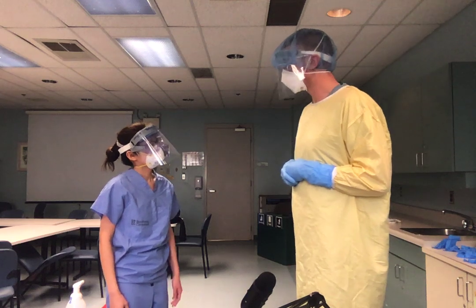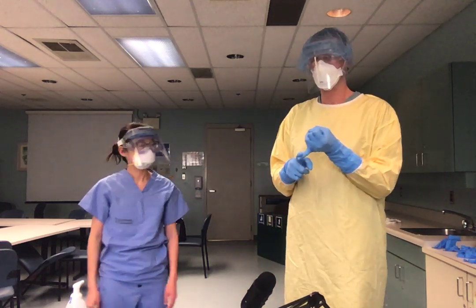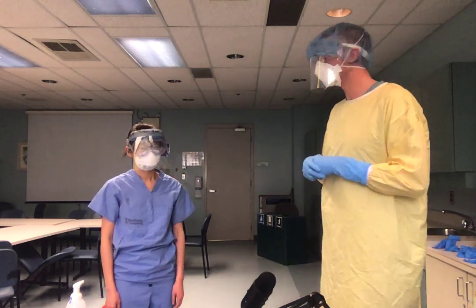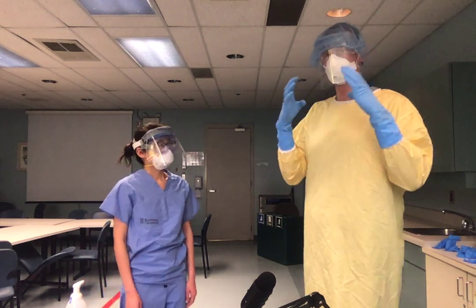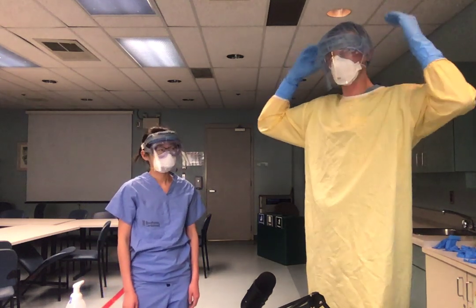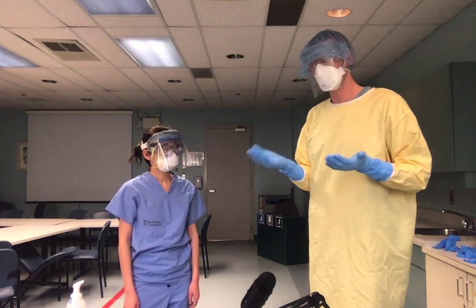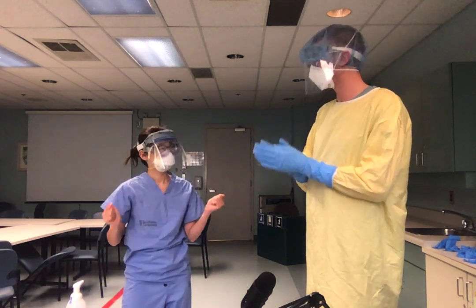Perfect. So at this point, you're ready to leave the patient room. You'll either be leaving into the ante-room or you'll be going into the hallway. Okay? So once in the hallway, what we have left is a lot of our headgear, right? She's got her N95, her goggles, and her visor. And we're just going to remove that in a top-to-bottom fashion. She's gone through a doorway into the anteroom or the hallway, so she needs to wash her hands again. We're just going to do a clap to symbolize that.